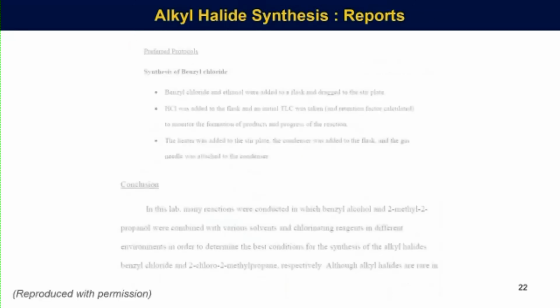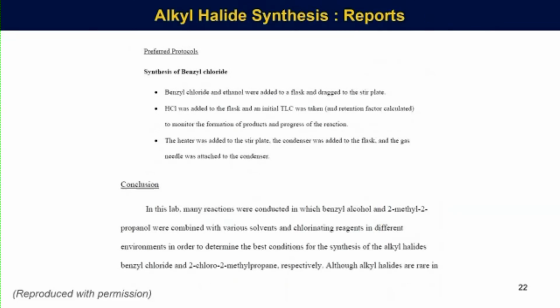And then they had to put together their preferred protocols. This was something that we really enjoyed doing, was preferred protocols. How do you think we're going to do this? Or what is the best method for doing this? Then at the bottom, conclusions. Every lab report should contain a conclusion, and they got better and better as the year went on, which is really nice.